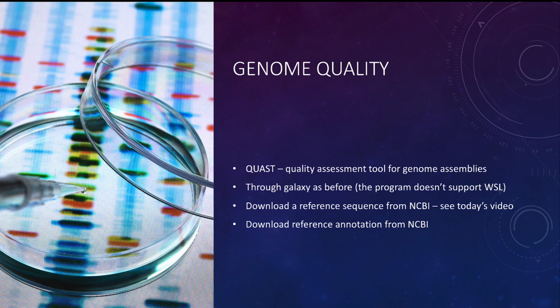One of the first things that we need to do is examine the quality of our assembly. So when we get the assembly back, especially from Abyss, we get that file of the statistics of the quality of the assembly in terms of how many unitigs, how many contigs, and how many scaffolds. The tool that we can use to look at the output from SPAdes, but also to really give us a better idea of, yeah, we have these pieces, but are these pieces good? Is a tool called QUAST, Quality Assessment Tool for Genome Assemblies.